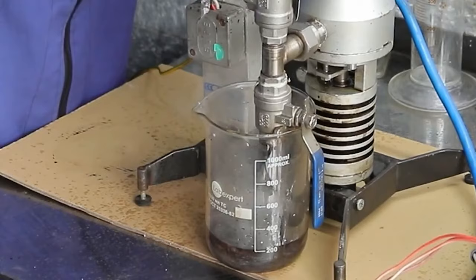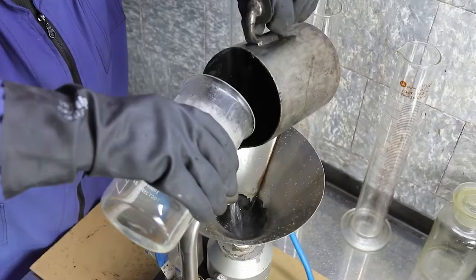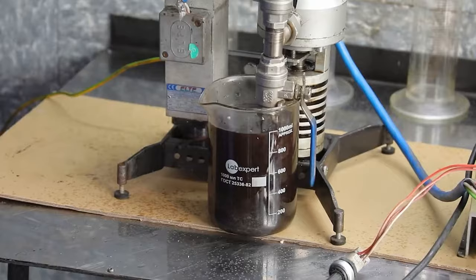If we look at the resulting bitumen emulsion, we will see that it has a brown color. It is homogeneous and contains no inclusions. These are the first signs of good quality emulsion.